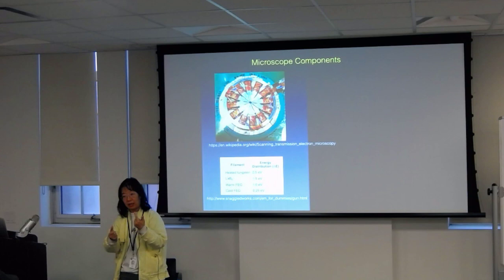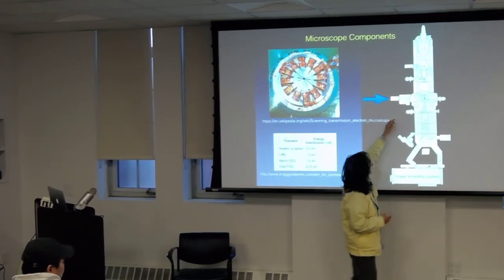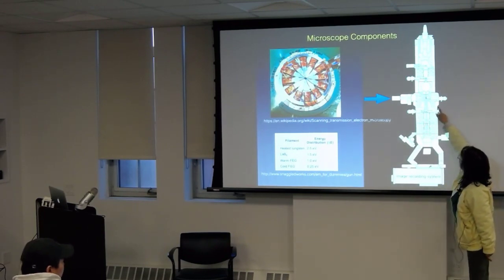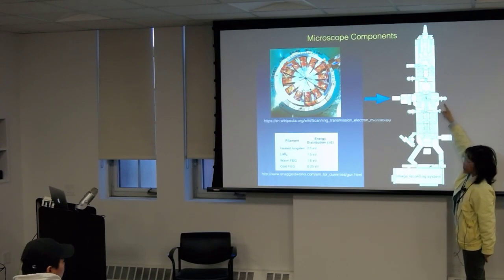Now, the last thing on here, I'm going to give you the pointer. Here's where you put your specimen, forming your image. It always has an aperture in there. It's so small, usually you can't even tell what it is. But there is an aperture.